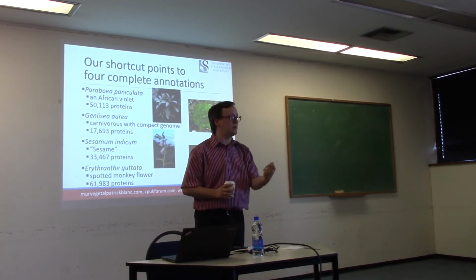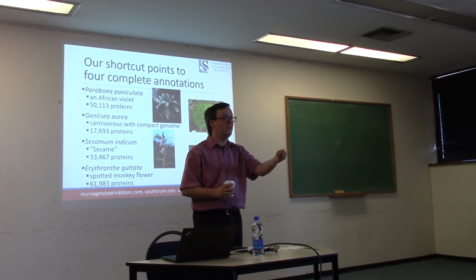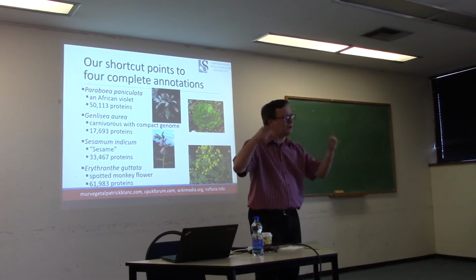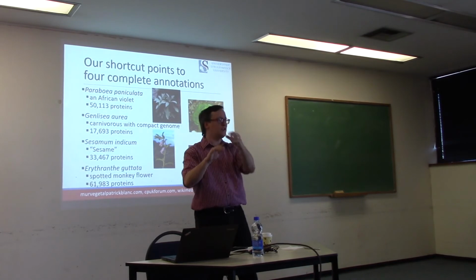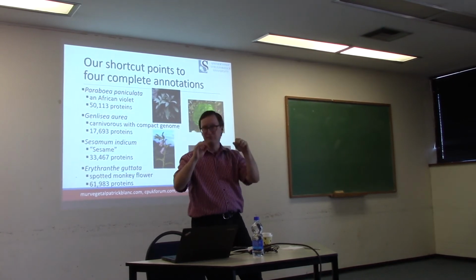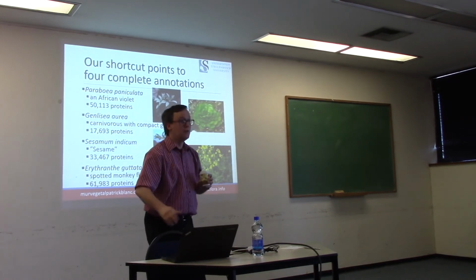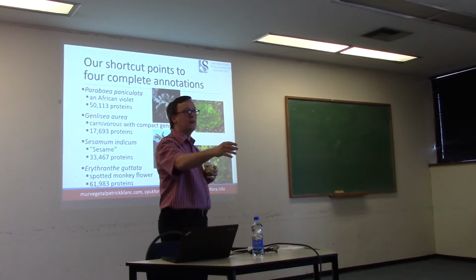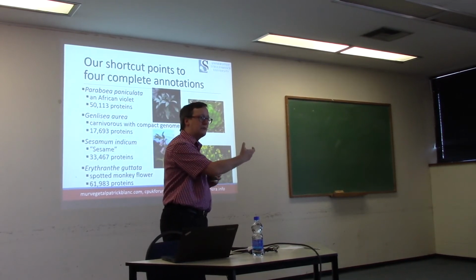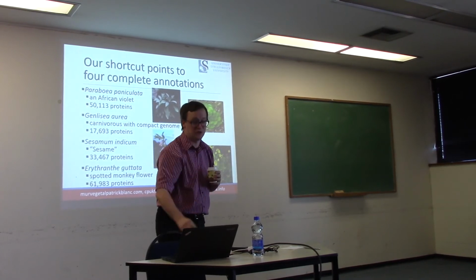So with these 4 nearby neighbors, these are the closest annotated genomes we can find. We can grab down these protein sequences, and then when our transcript hits one of these in BLAST, we can feel pretty comfortable. We're going to try to use the same reciprocal best hit rule. We feel pretty comfortable about transferring that annotation to say, this is a putative, whatever you want to call it, glycolysis protein, whatever. So we have this option then of using existing annotation information to let us know whether these transcripts have likely functions through homology.